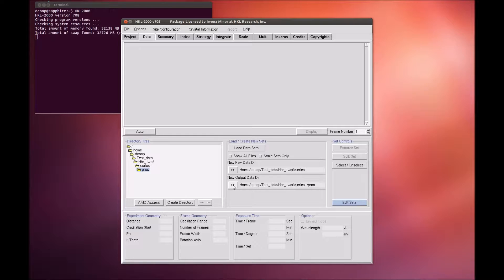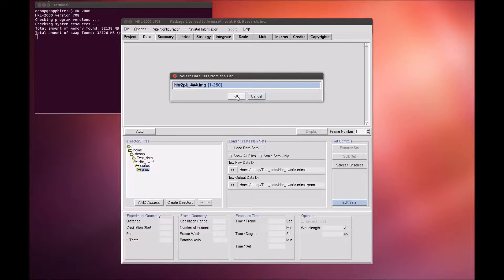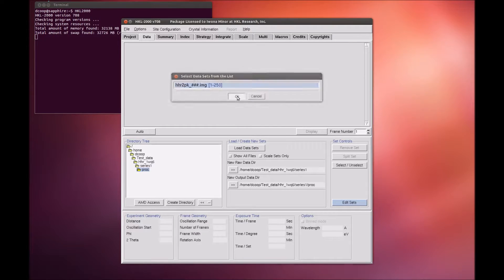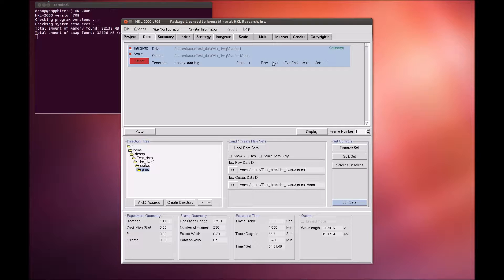Select the images you want to process using the Load Data Sets button in the middle of the interface. This will open a dialog with the images grouped together by file name pattern, followed by the range of images that fit the pattern. Here, we see that there are 250 images that start with HHR2PK.